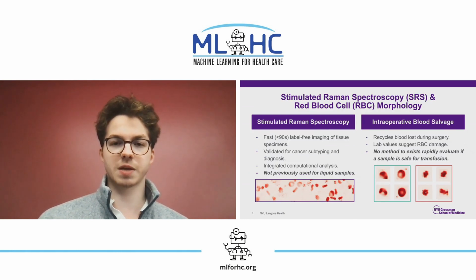Stimulated Raman spectroscopy offers fast, label-free imaging of tissue specimens right in the operating room at the point of care. It's been used to diagnose cancer in the OR, but to our knowledge has not been previously used for liquid samples.